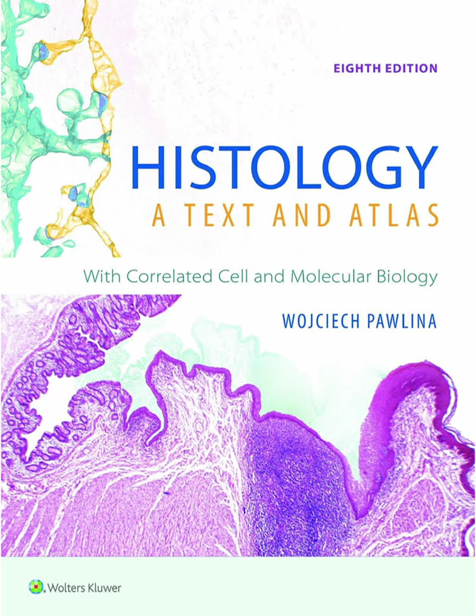Blue-purple for the nucleus. Got it. After that, we dehydrate the slide again and then stain it with eosin. Now, eosin is the opposite. It's an acidic, negatively charged dye. So eosin loves the positively charged components. Like proteins? Yes, like the amino groups of proteins. So it stains most of the cell cytoplasm and the extracellular fibers like collagen, a vibrant pink or red. So you get blue nuclei and pink cytoplasm. Generally, yes. That combination gives you this stunning contrast, painting a detailed map of the tissue. Makes sense. Then just a few final steps. Dehydrate it again. Clear it usually with xylene, mount it in a non-aqueous medium, and add a cover slip. That makes a permanent preparation ready to view.